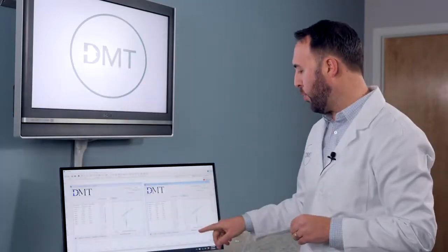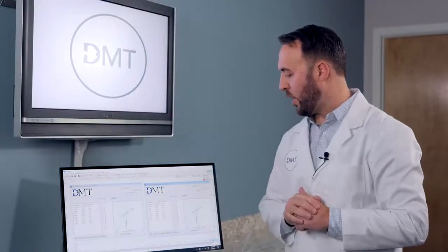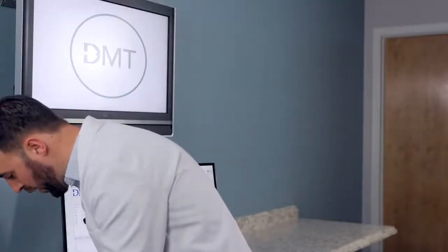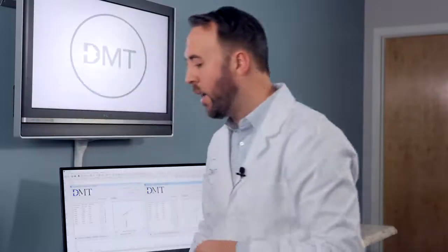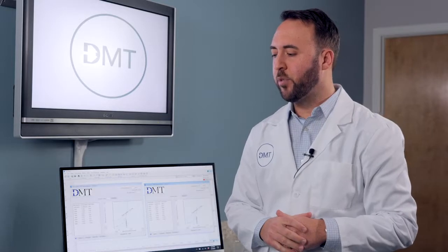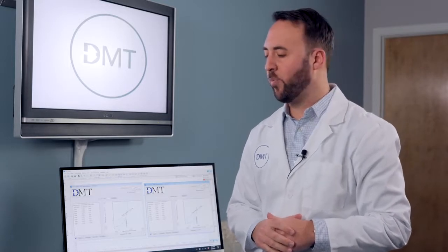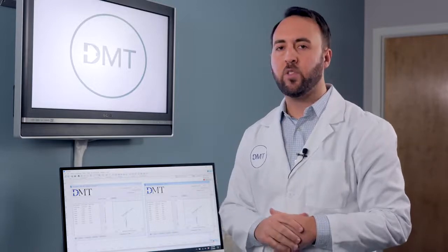And channel 2 has also passed it. And in this case, its reading is set to 2076. So we will move these back to those values. And now that you have done this, you can zero your chambers, your reading for chambers 1 and 2. And this is the point at which you are ready to move on and start the wake-up protocol.